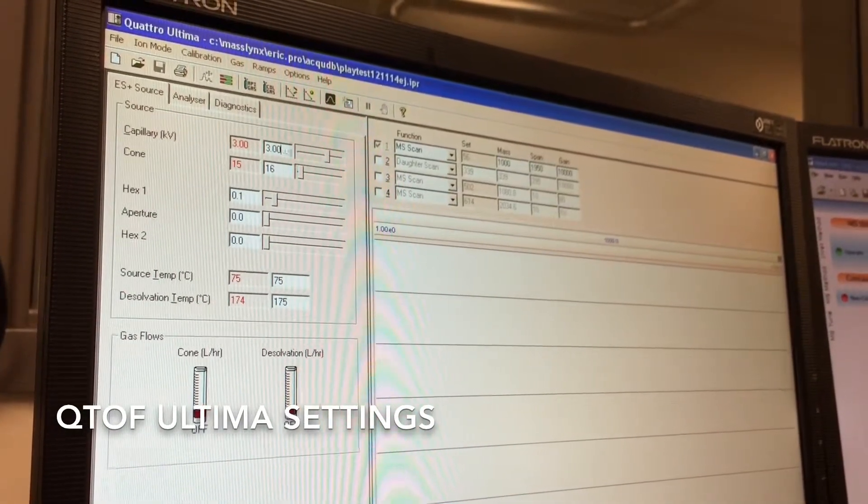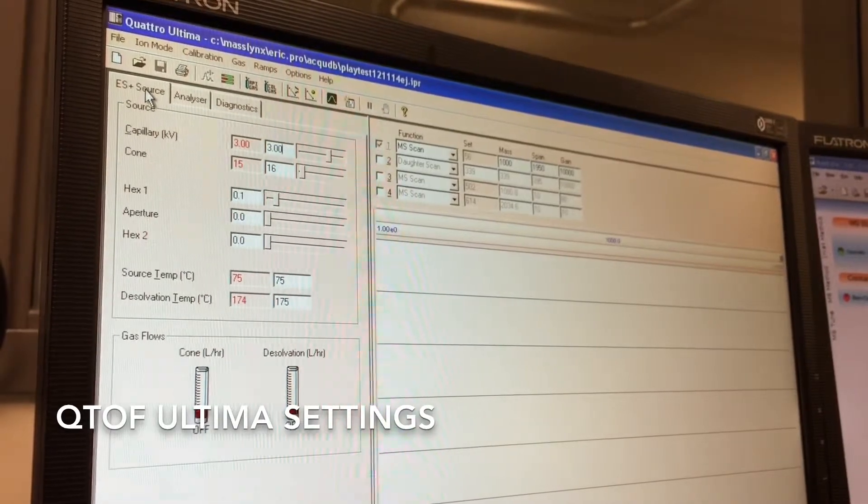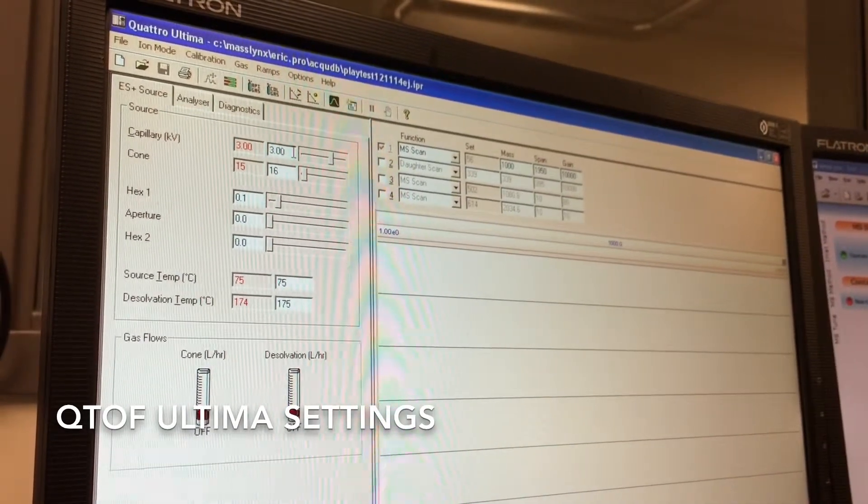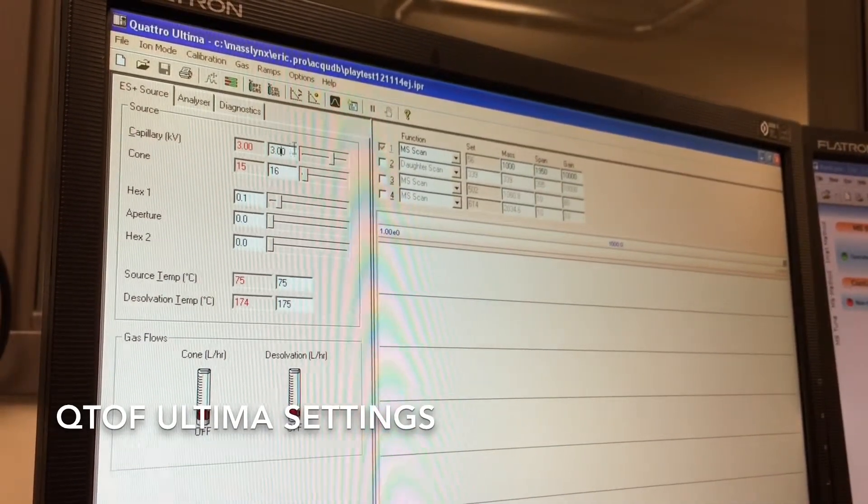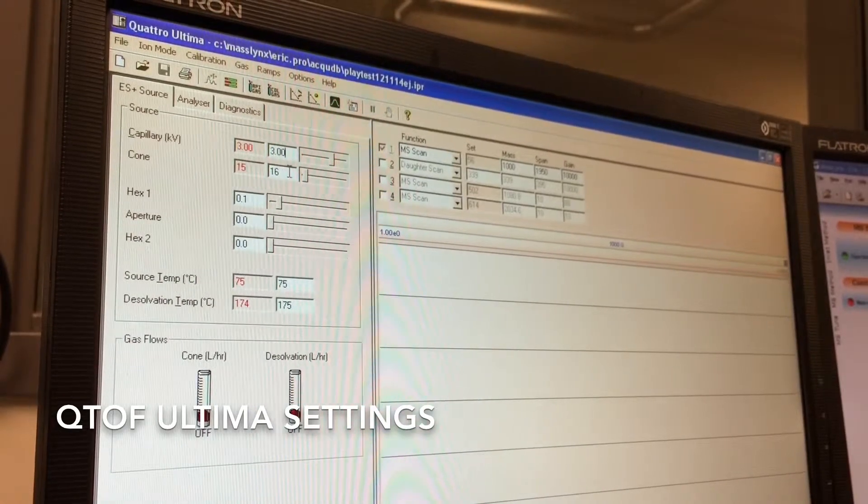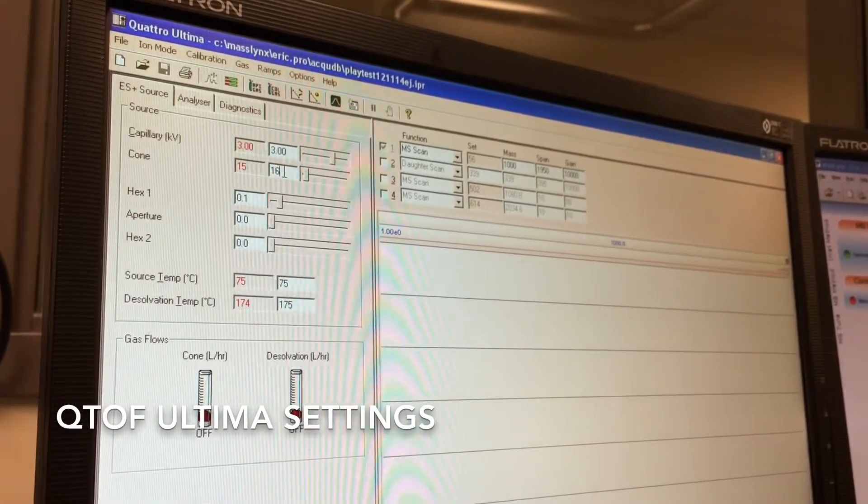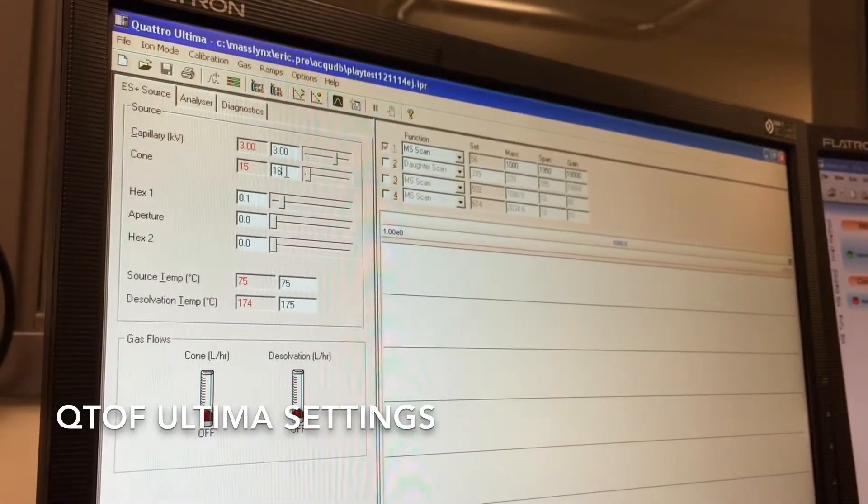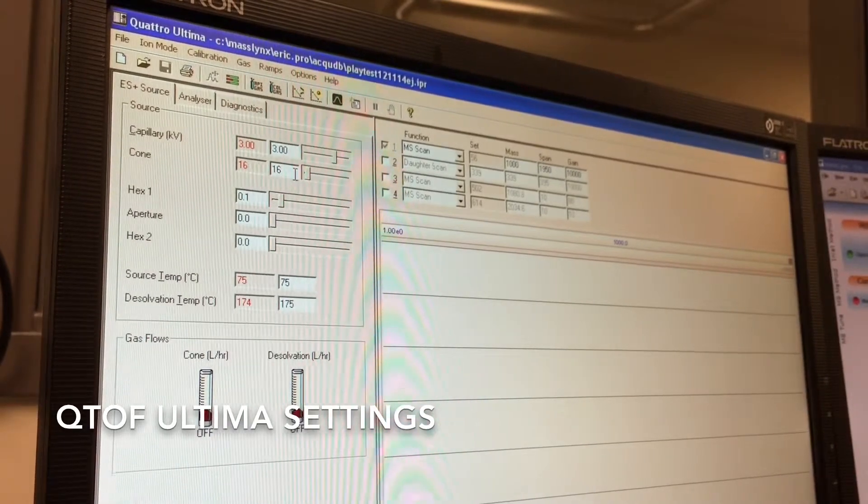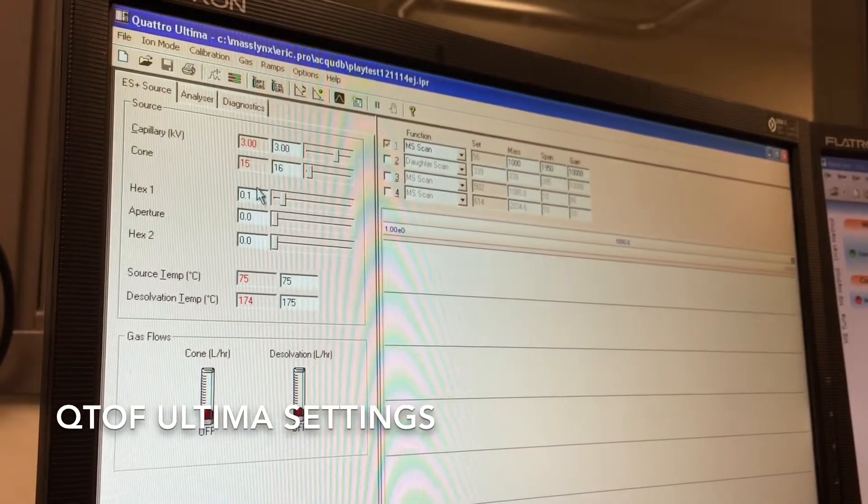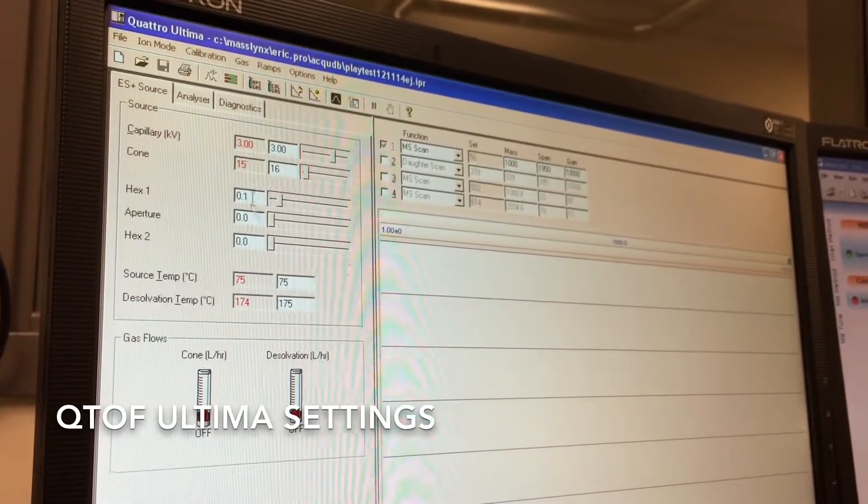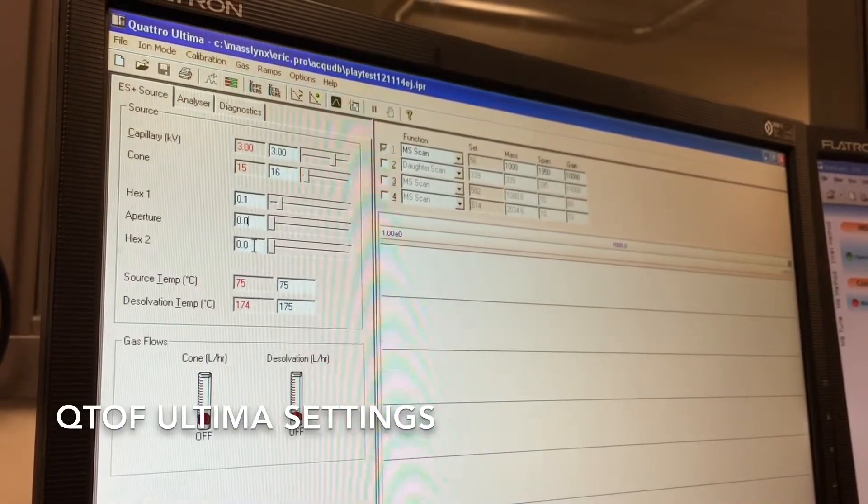The first value here under the ES and Source tab, you want the capillary to be at around 3 kV. The cone is variable, but 15 to 30 is generally where you're going to leave this cone voltage at. The hex and aperture and hex 2 can all stay static, 0.1, 0 and 0.